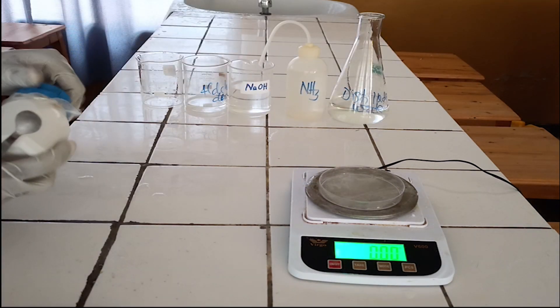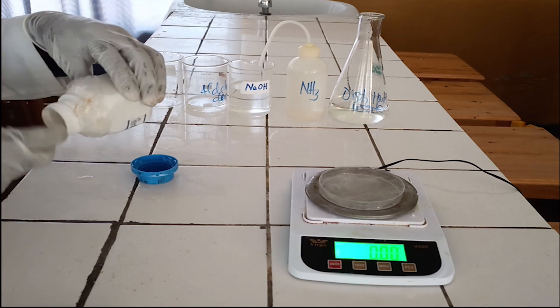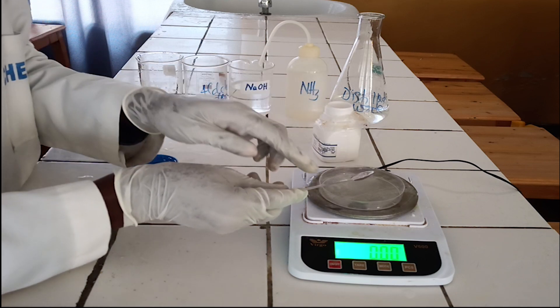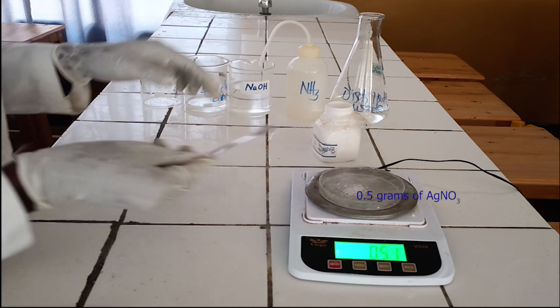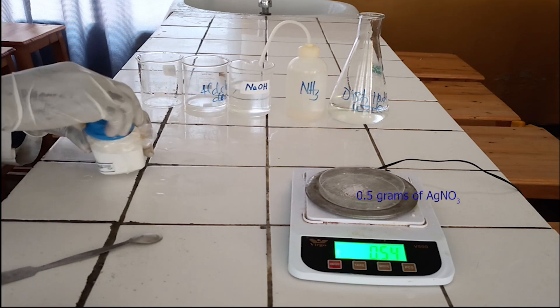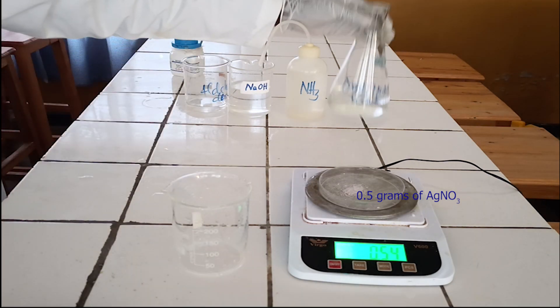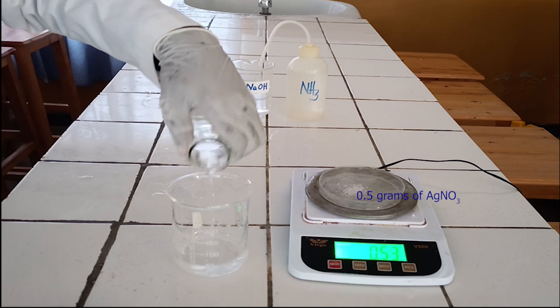There are two ways for preparation of Tollens Reagent. Let us start with the first way. Set balance to zero and weigh around 0.5 grams of silver nitrate. Pour 50 milliliters of water in beaker and dissolve 0.5 grams of silver nitrate in it.